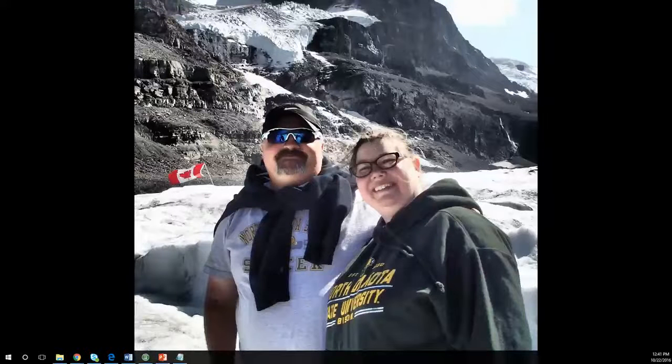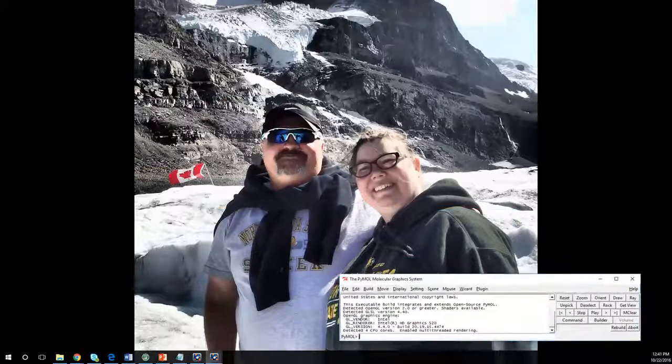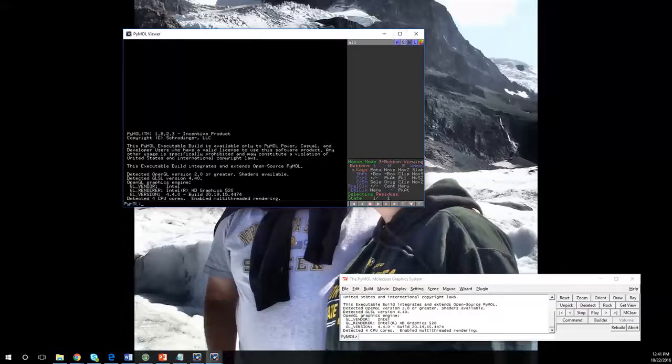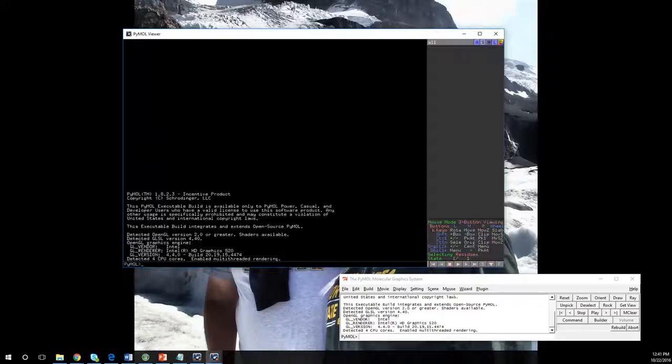Okay, let's go ahead and get started. I'm going to show you a couple things today. I'm going to show you how to bring your molecule in, how to color, how to see the functional groups, and how to rotate the molecules, how to add some labels, and how to zoom. The next lecture or tutorial I'll get you learning how to do scenes.